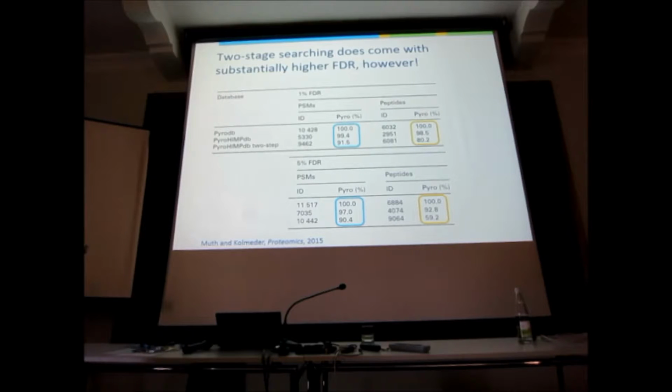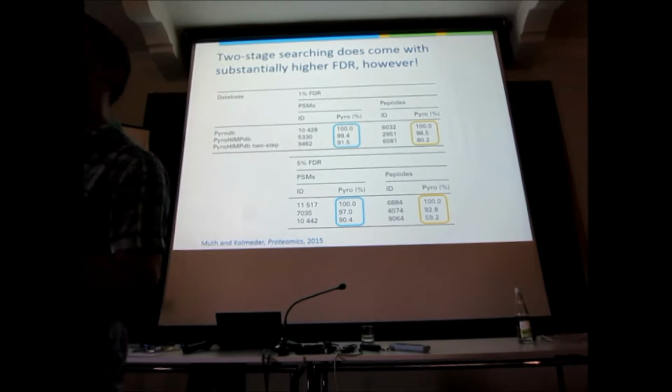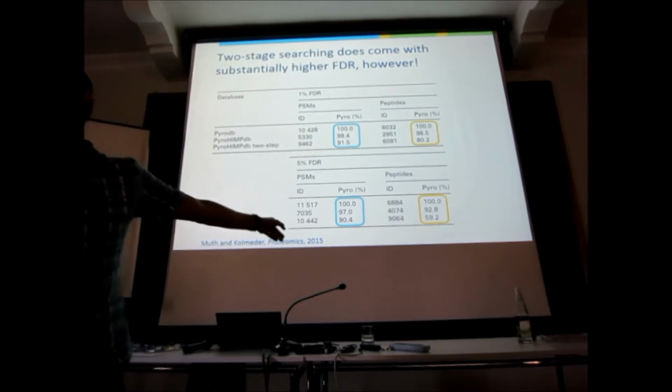At 5% FDR, things are exactly the same. We control the FDR by sacrificing a lot of hits. But when we do the two-stage search, here it goes off the rails, there it explodes in your face. This is 60% is right, 40% is wrong. And people publish and they say, I did this, and I've got 5% FDR. And it's not their fault, right? It's not their fault. But now we can see that this creates problems.